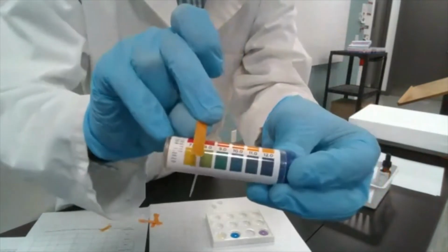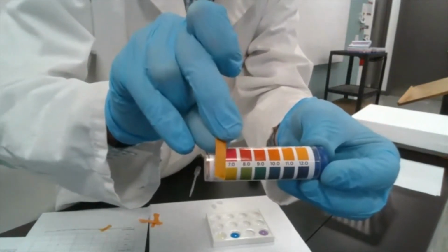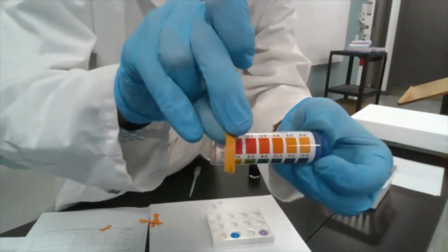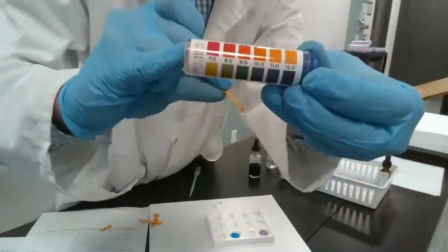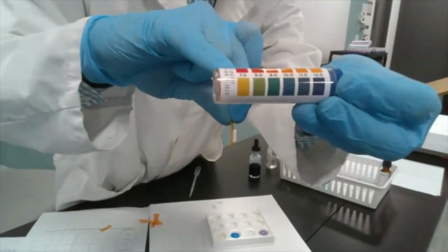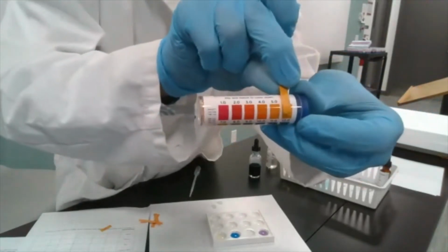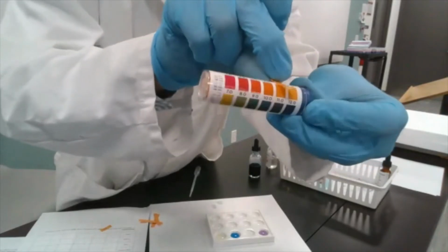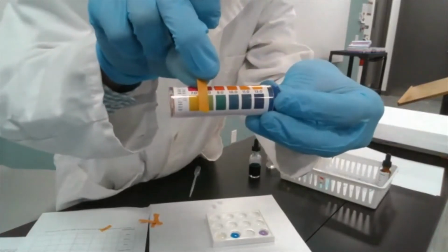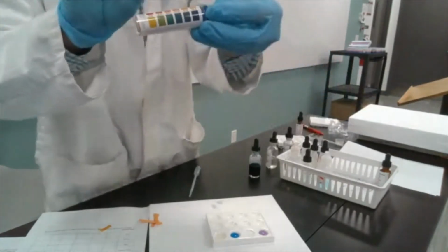So if I look closely, it actually looks more like between 7 and 8, right? Because you see that 12 is printed over the deep blue, right? So it's definitely not that. So it may be 6, but it has some greenish hint of green to it. So I would say this is probably between 7 and 8, more close to 7. I would write down it as 7.